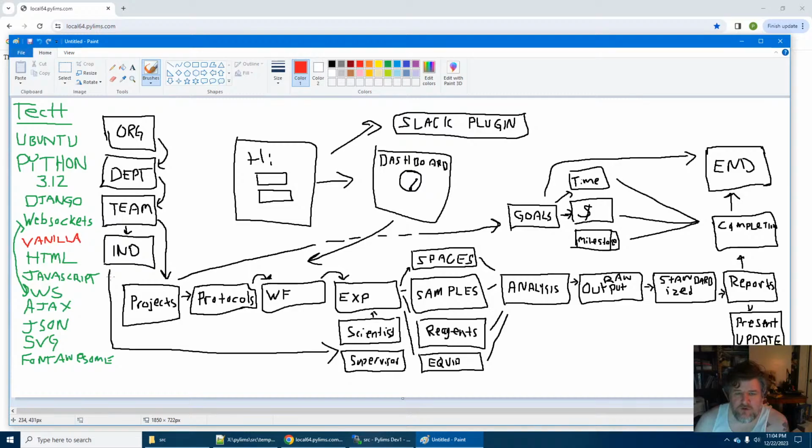The reason I'm going to try to not use too many libraries is, A, I just like to code, and learning a bunch of libraries kind of takes away a lot of the coding part of it, and you just use other people's code, which is fine sometimes, but I find that I spend too much time trying to figure out how to get things working, whereas if I code it myself, I can just make it work, and when I want to change it, I can change it easily. I can make it do exactly what I want.